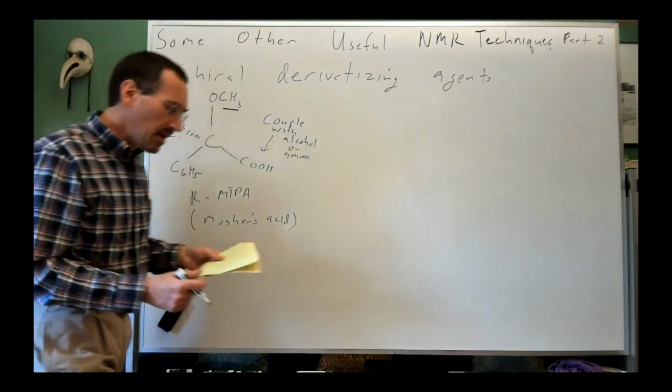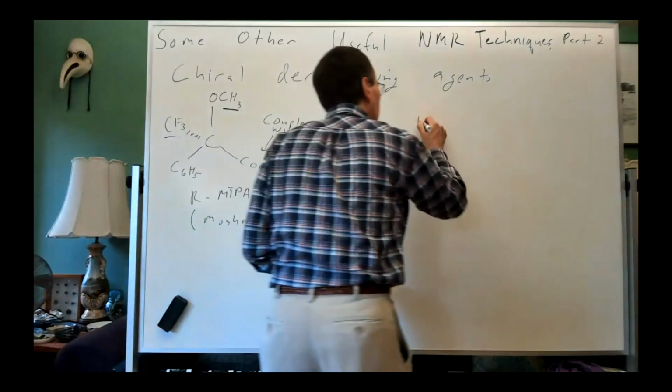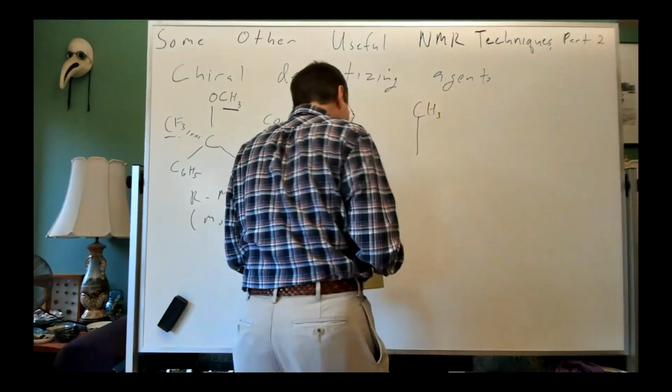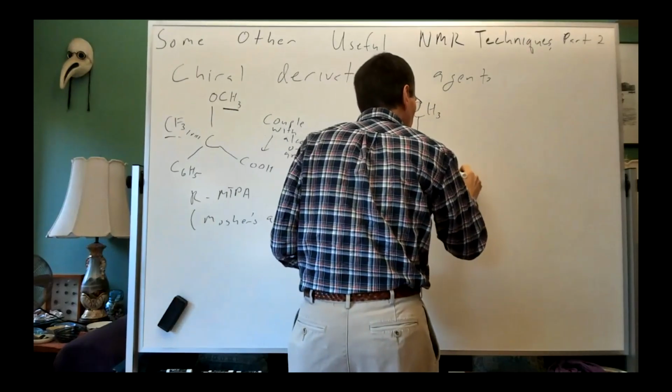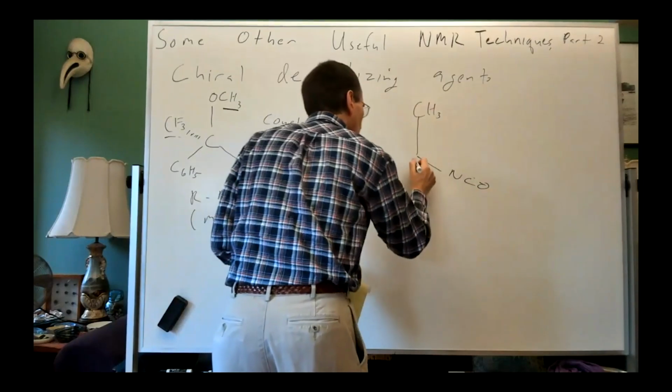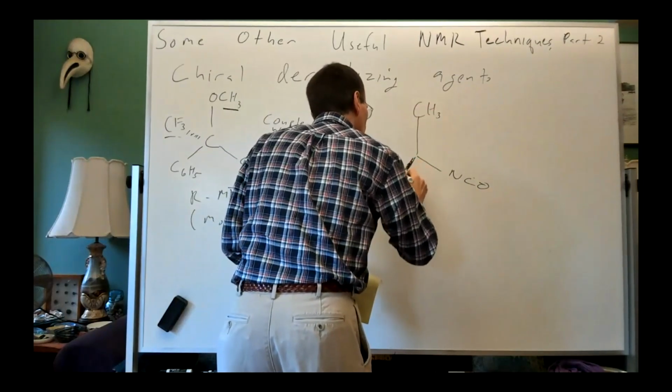So that's one. Another useful reagent or set of reagents are isocyanates, and particularly the isocyanate of phenethylamine is nice.